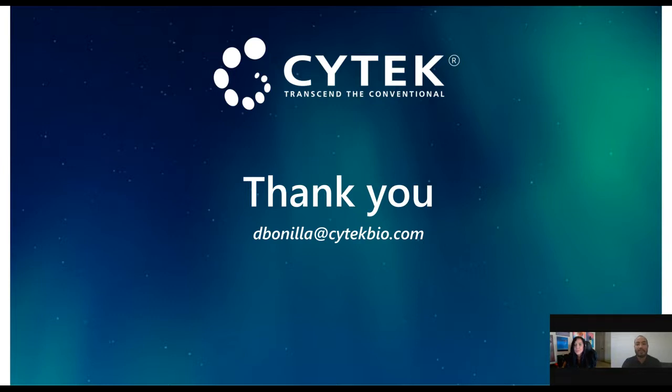Thank you. The next question: can you create an autofluorescence tag from data that's already been acquired? And on a similar note, there's a separate question: is autofluorescence extraction done post-analysis, or can we see the results live? Sure, we can do it live, because once you record your unstained sample and your reference controls, you are able to do the unmixing, and so that's live. You can acquire your sample live after doing the calculation, after doing the extraction. It doesn't need to be done after acquisition, but both options are available.